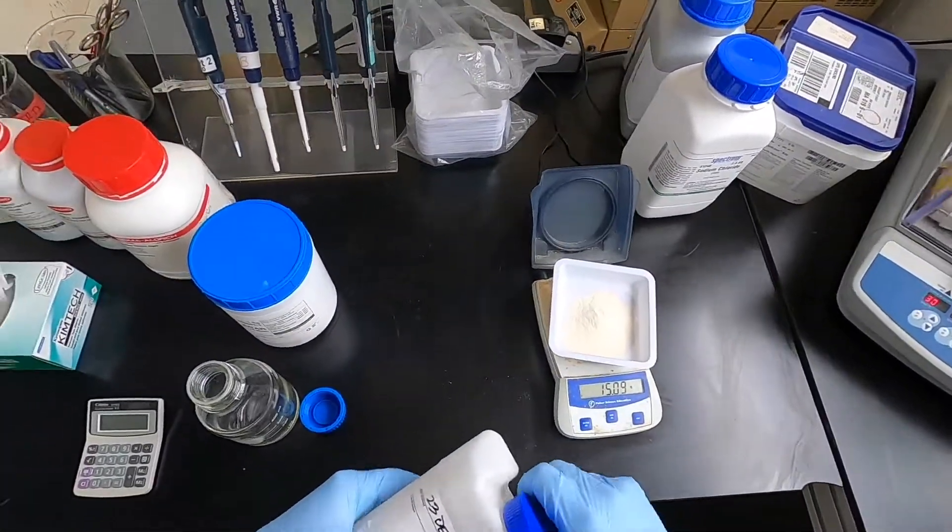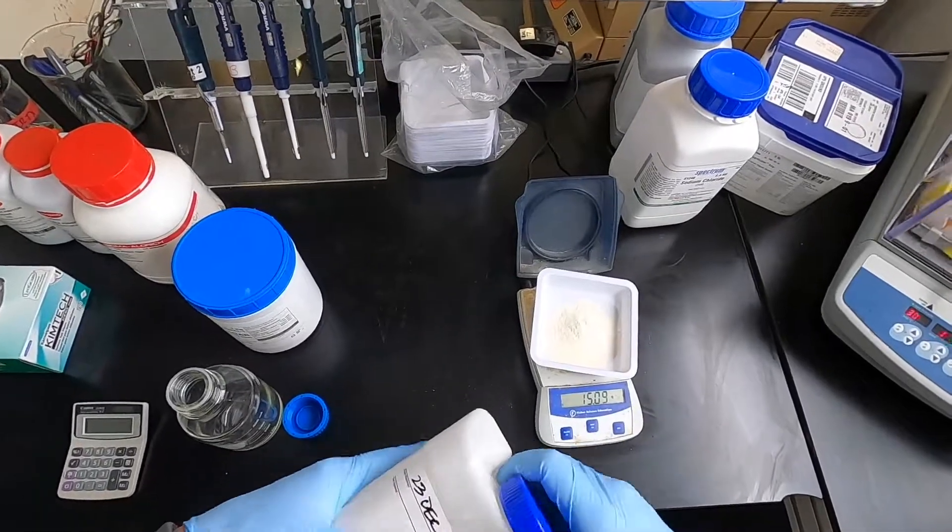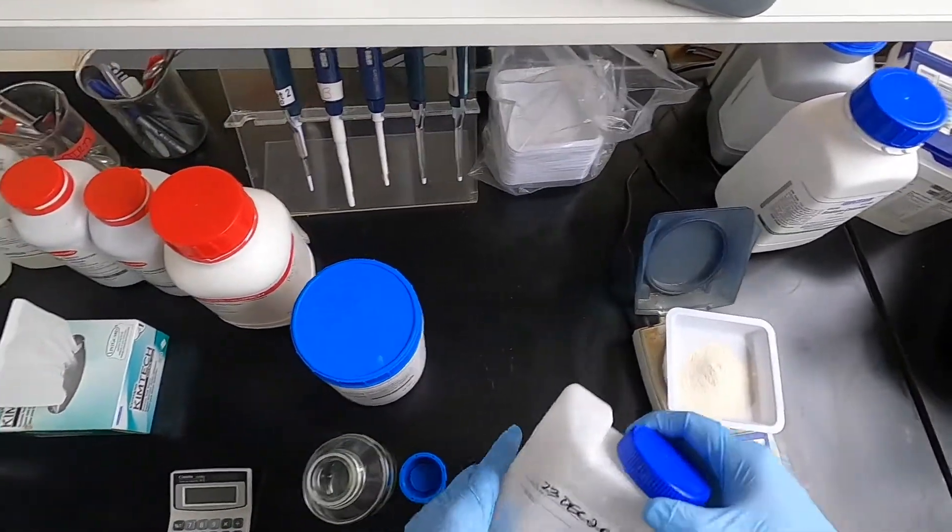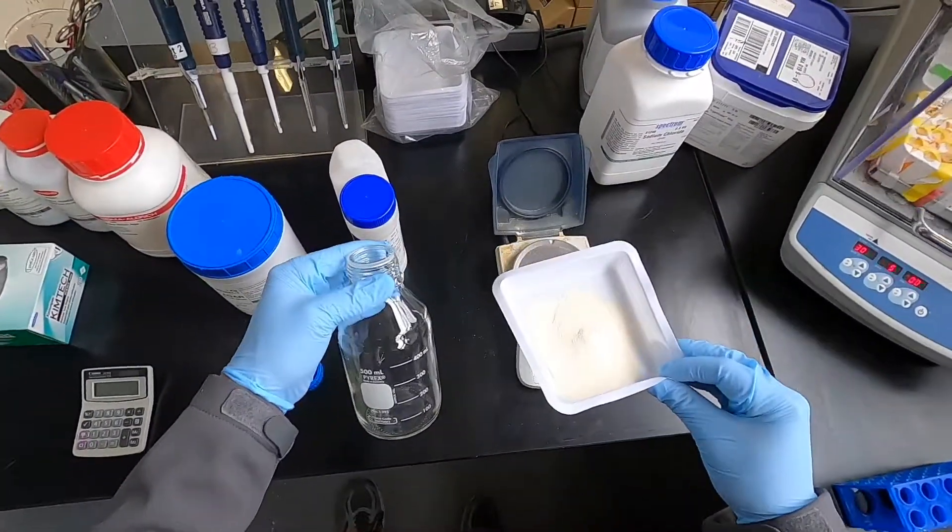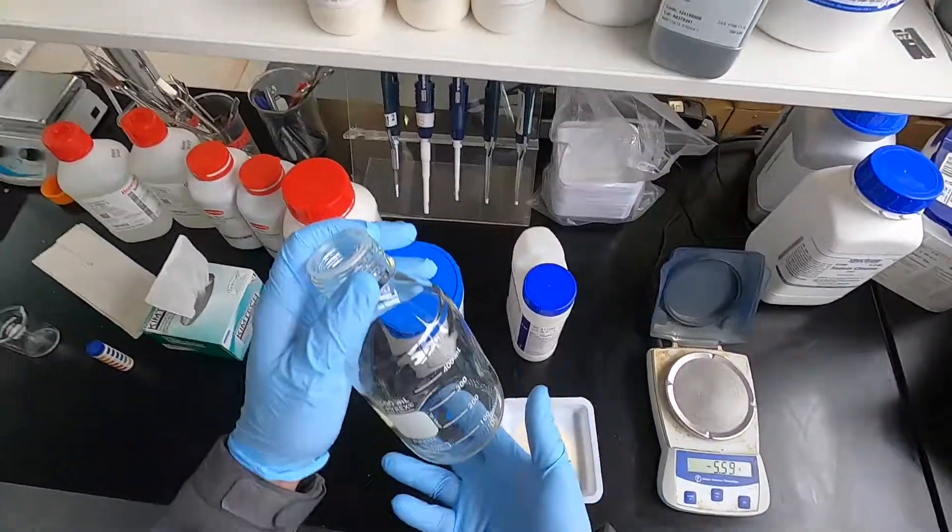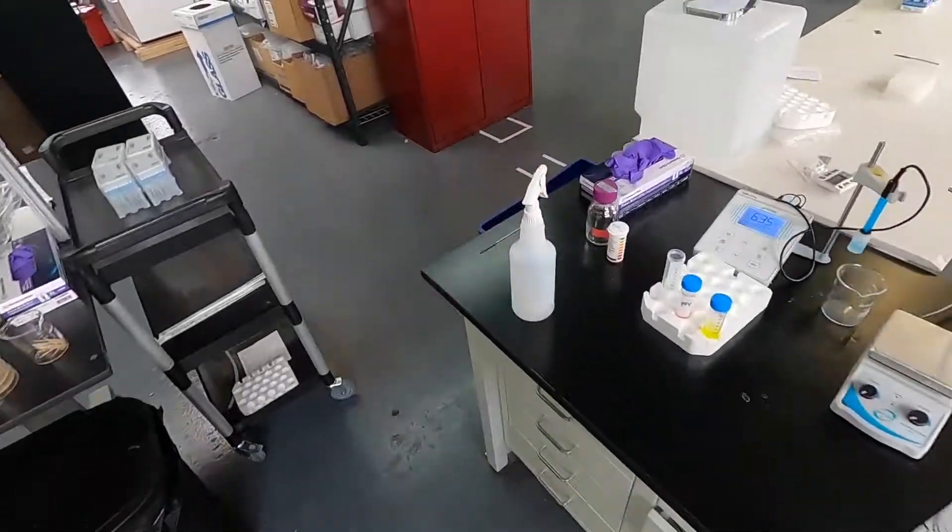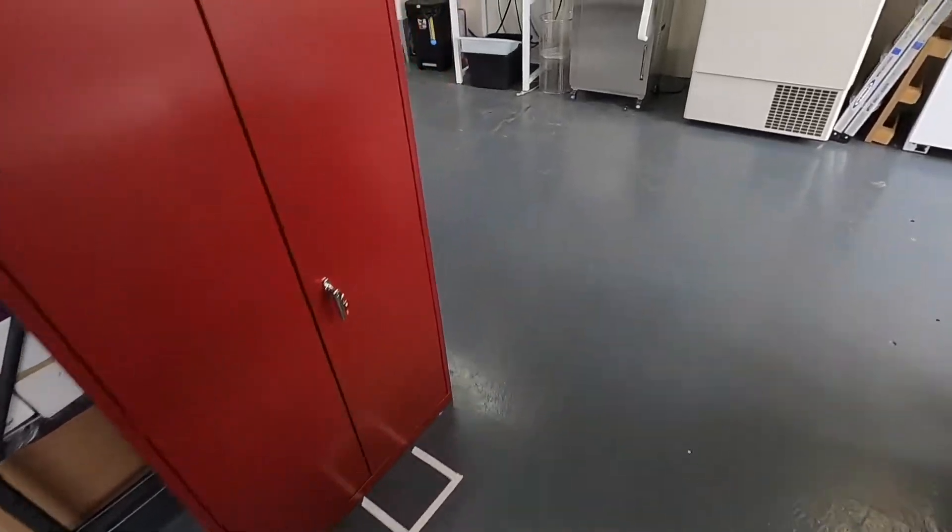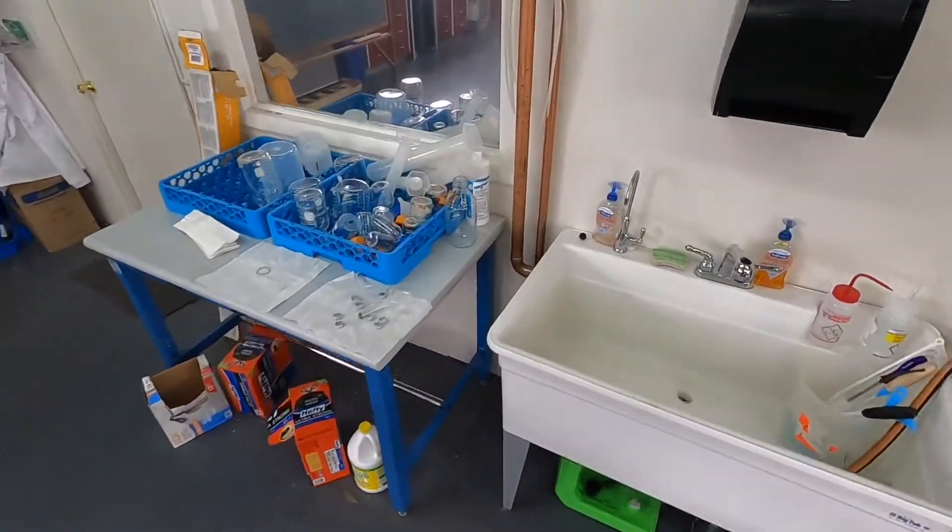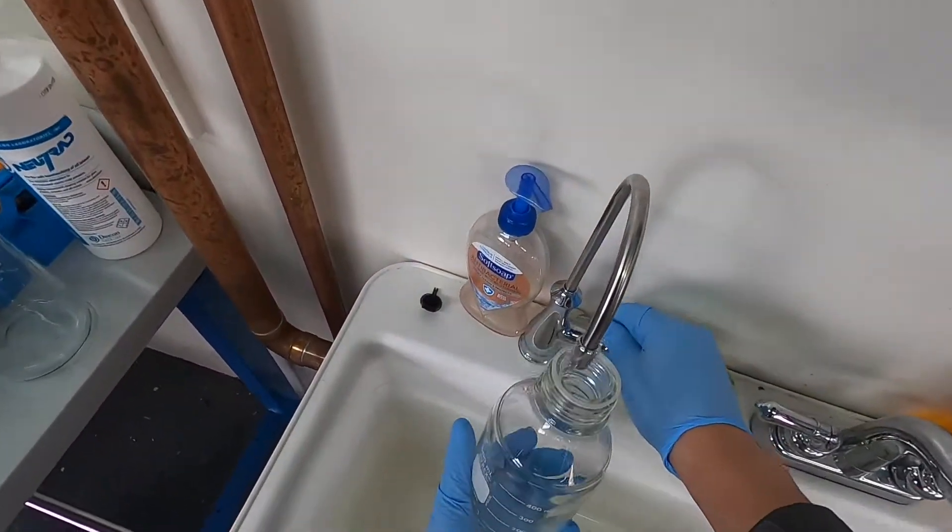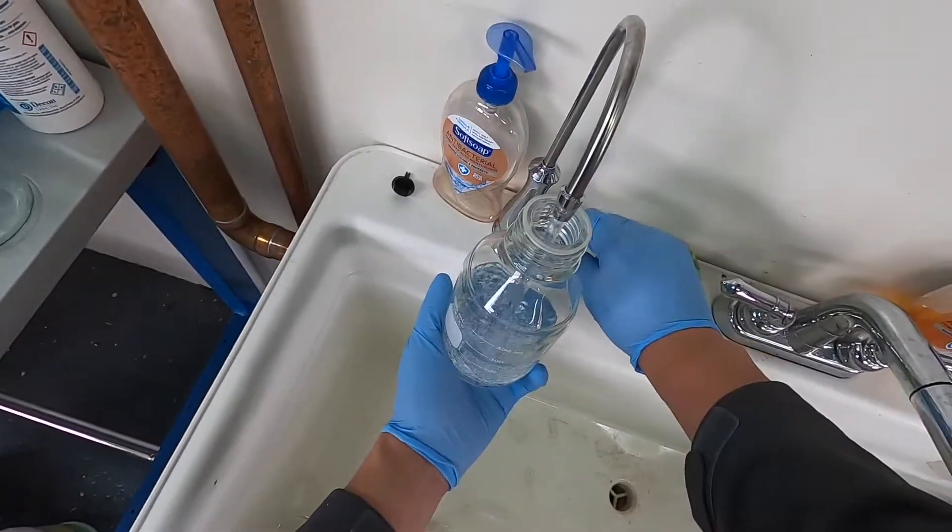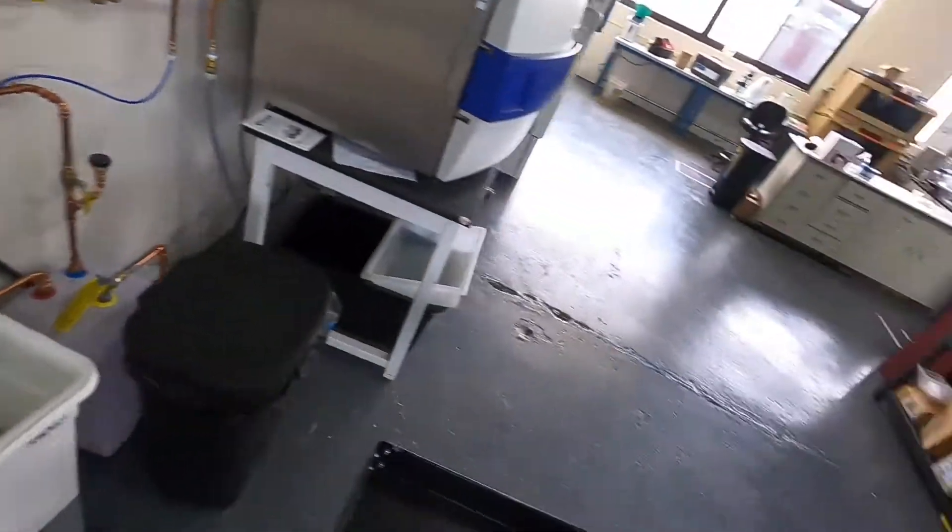We're going to measure out 15 grams per liter. So there's a lot of small things that happen in the lab that you slowly pick up over time. If I put this directly into the media bottle, what'll happen is when I put the water in, this will just stay dry and caked on the bottom, and then it's a pain to get off the bottom. And if you don't mix it before you put it in the autoclave, it will just burn the powder.